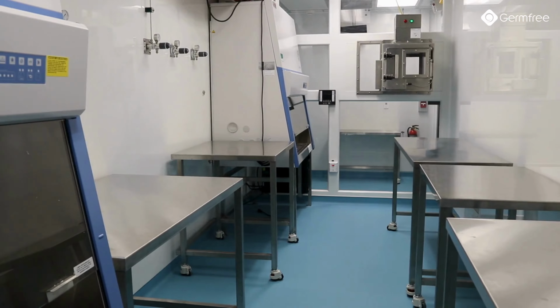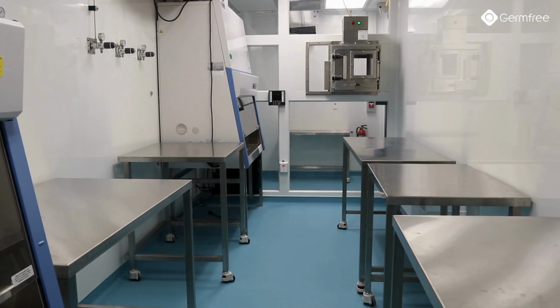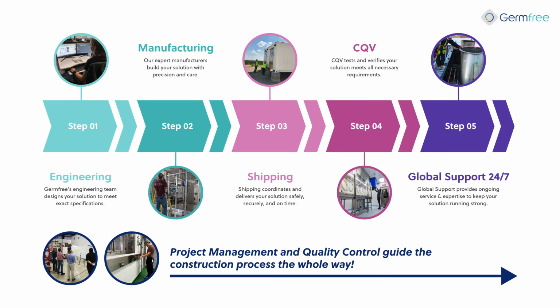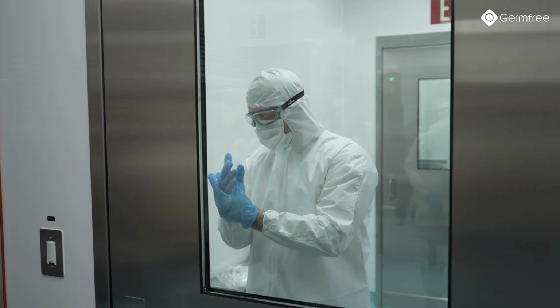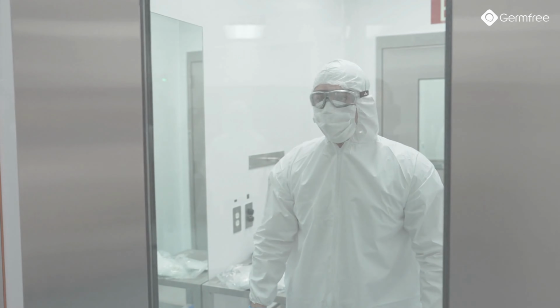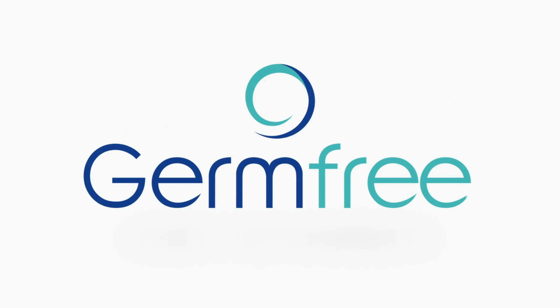From capturing your vision to commissioning and beyond, Germfree's process is designed to deliver clarity, precision, and confidence at every step. Every facility we build is more than just a structure. It's a turnkey solution built to perform, compliant, and reliable, helping you serve patients safely and efficiently around the globe.